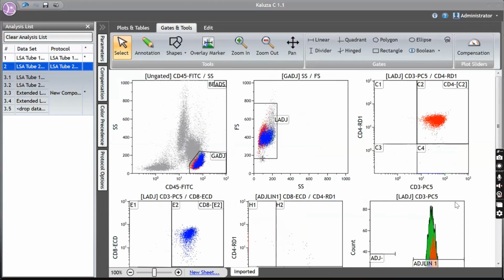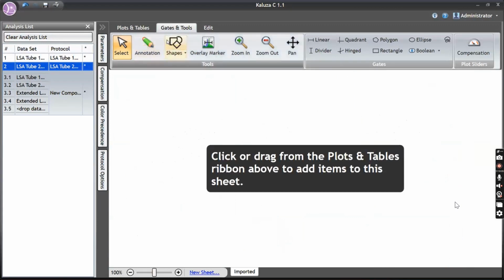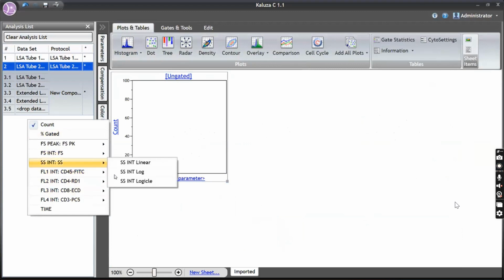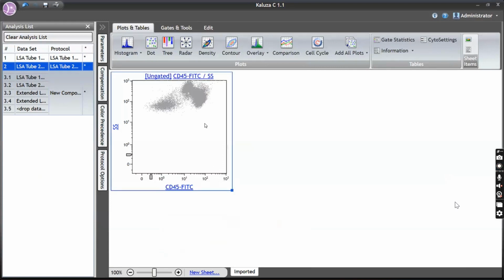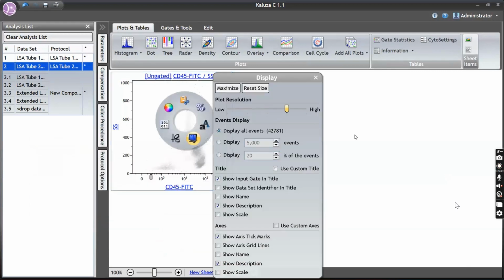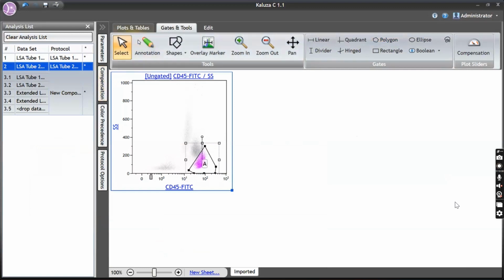Now similarly, you have multiple plots here, which I'm not interested in. These are all auto-locked protocols, so what I do, I'll draw my own gates. The same gates, but due to time, I'm not drawing the time plot and the singlet plots, which is wrong. So some doublets may be mixed here, but initially you need to start with the time plot, live, then a viable gate, then singlet gate, and only then come here. But because of time, I'm directly going with side scatter CD45.